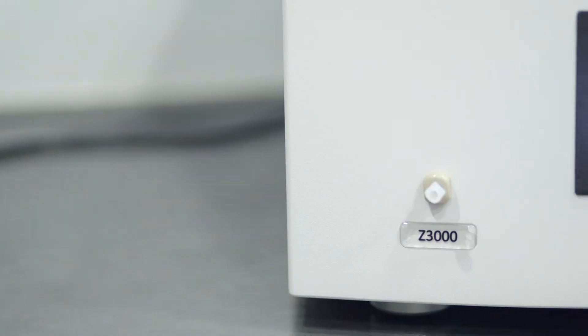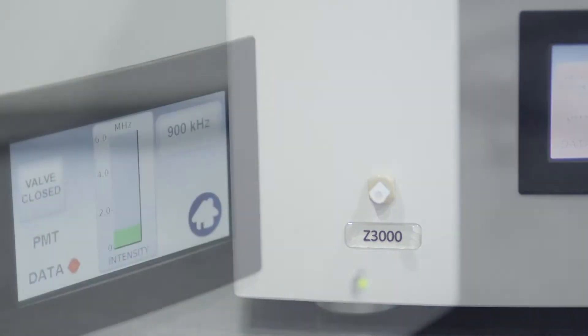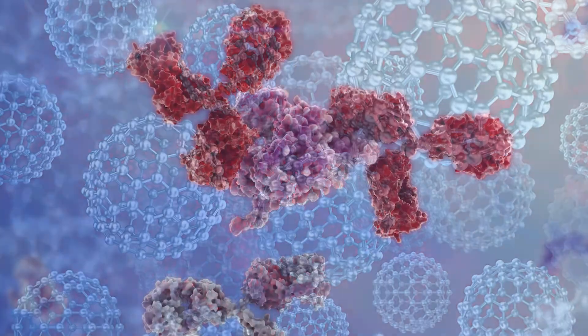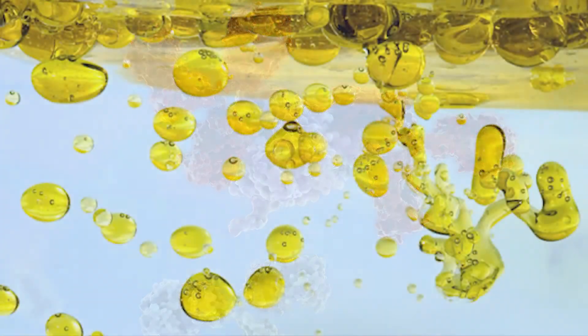DLS is the preferred technique for measuring the size and zeta potential of submicron particles, including nanoparticles, colloids, proteins, and emulsions.